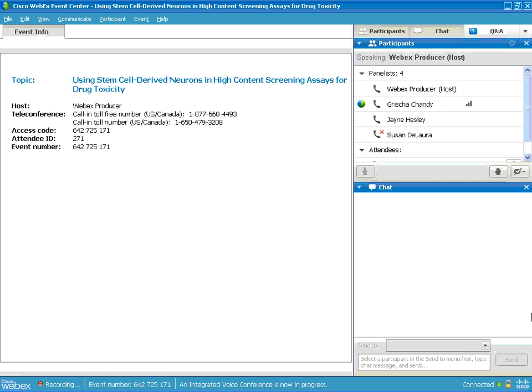To answer the question online, the system is capable of taking data from a number of dyes as well as bright field. At any one time, people have acquired up to 5 colors if you pick the right fluorophores. Usually people are doing things in the 2, 3, and maybe 4 color range. That's exactly true.